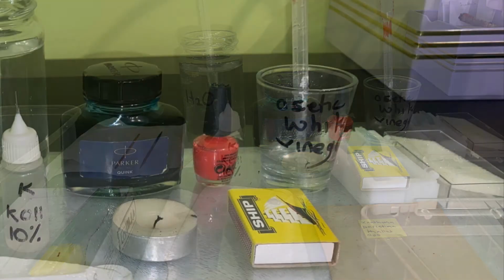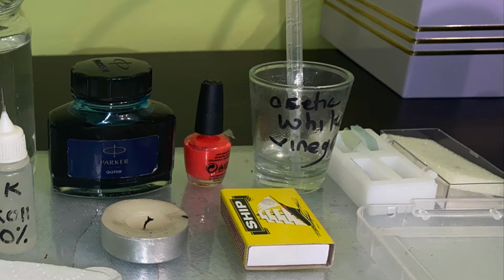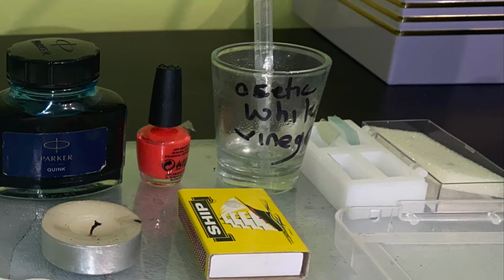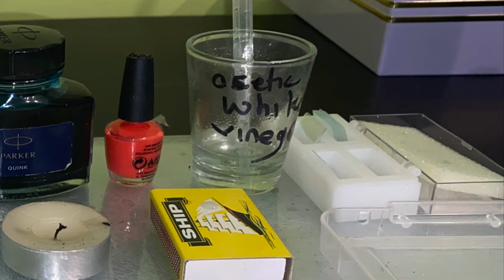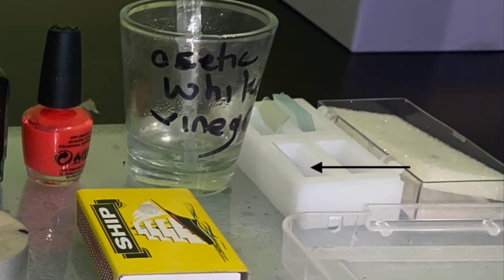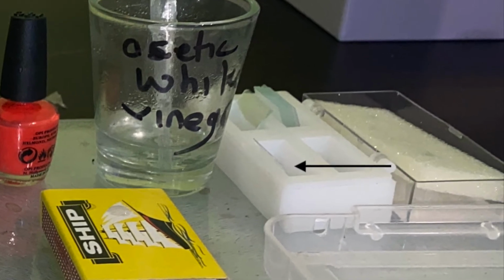It is also worth selecting out one glass cover slip and moving it to a convenient place so it is easy to pick up during the process. In this case, I have put it in a separate chamber in the cover slip box.